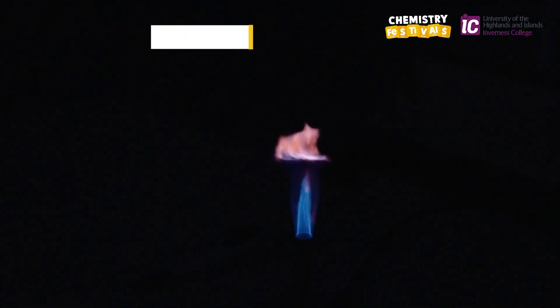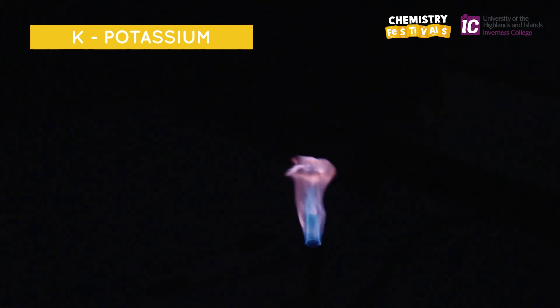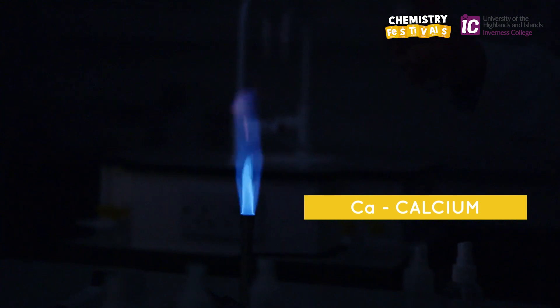I'm spraying metal C, which is potassium, into the flame, and it turns the flame a beautiful lilac colour. I'm spraying metal D, which is calcium, and this produces a brick red flame.